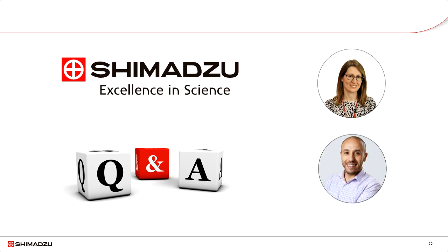All right. Yeah, so continuing with the. Go ahead, sorry, Simone, I moved on. I was just saying, there are ways also to automate the sample prep side, but definitely on the software side, we have automation solutions to acquire a lot of samples. Yeah, definitely.